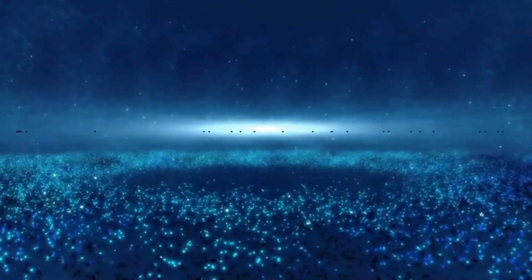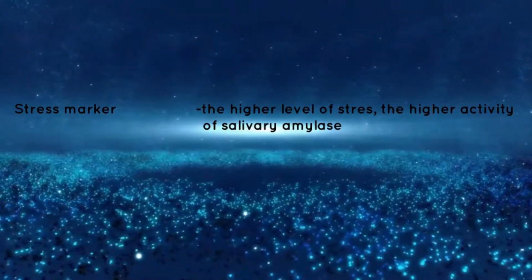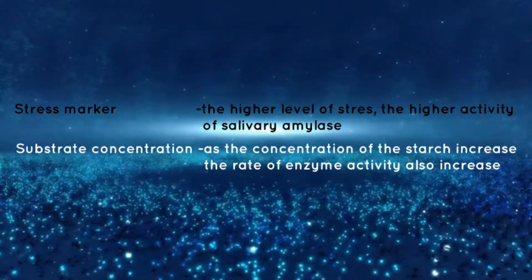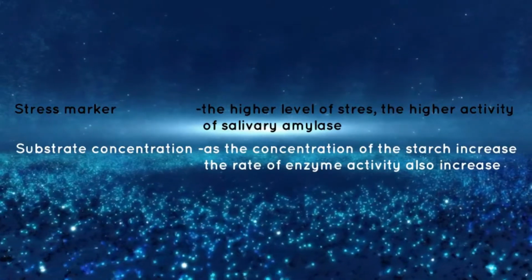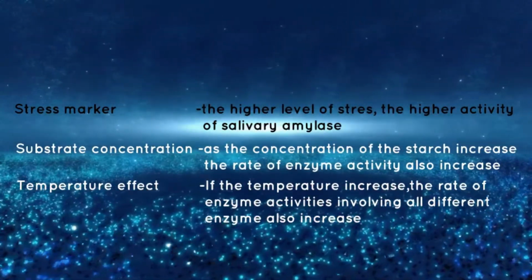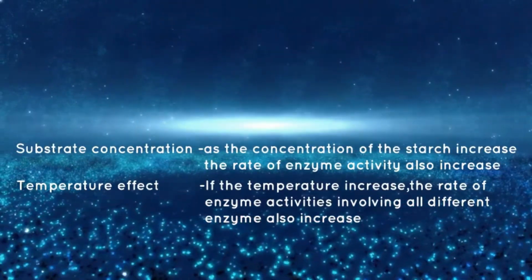Stress marker: the higher the level of stress, the higher the activity of salivary amylase. Substrate concentration: as the concentration of the starch increases, the rate of enzyme activity also increases. Temperature effect: if the temperature increases, the rate of enzyme activity, involving all different enzymes, also increases.